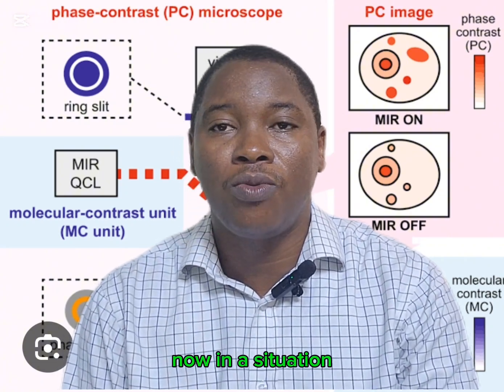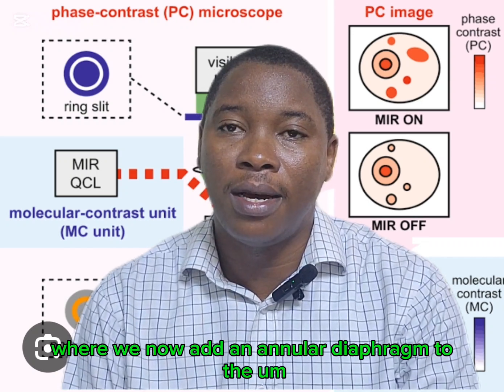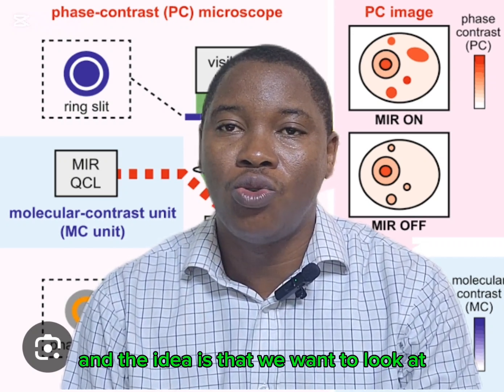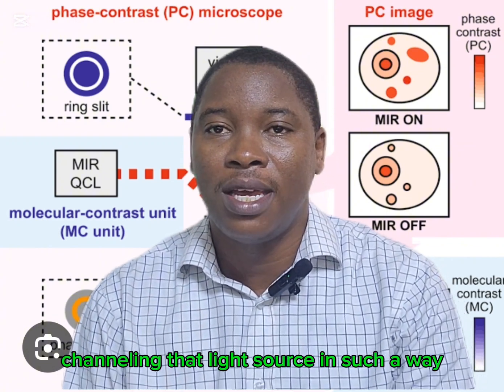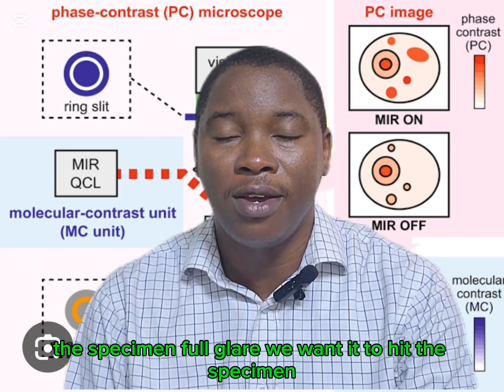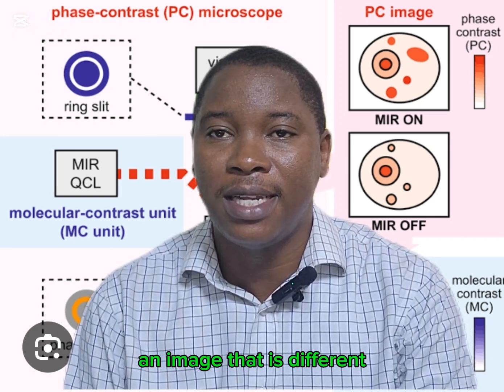Now, in a situation where we add an annular diaphragm to the condenser, the idea is that we want to channel that light source in such a way that it doesn't hit the specimen in full glare. We want it to hit the specimen in such a way that we can have an image that is different.